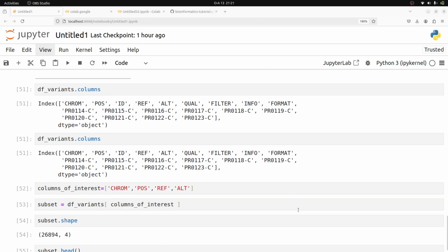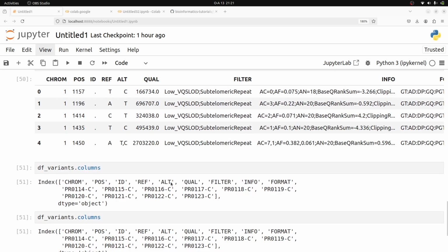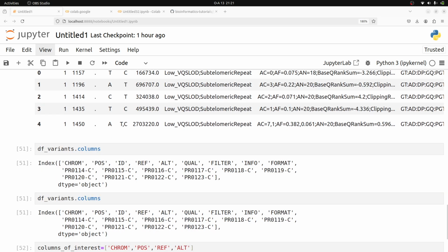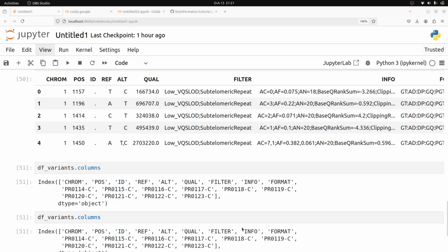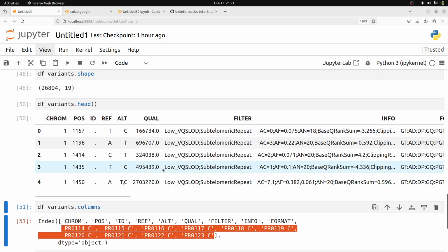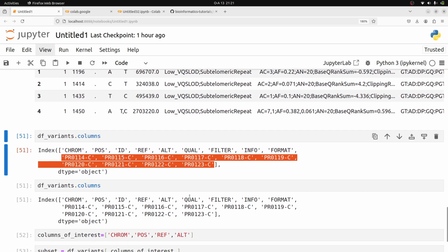Now what you should notice is that the approach I used is for selecting all variants. If you want to select the variants based on samples, there are other tools, or let me say there are tweaks that you have to use to be able to do that as well. For now, this is with the assumption that you are just extracting information other than sample-level variants. This approach may not be appropriate for that. But if it's just for the other fields, chromosome, position, ID, ref, info, format, etc., then this is appropriate.